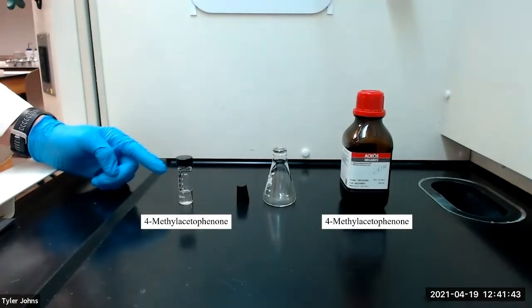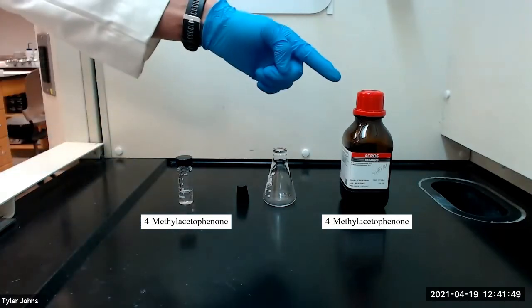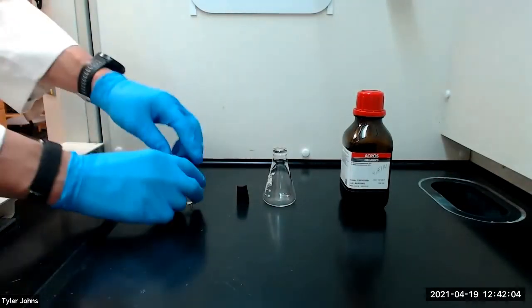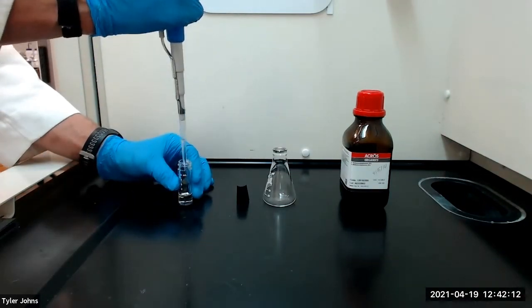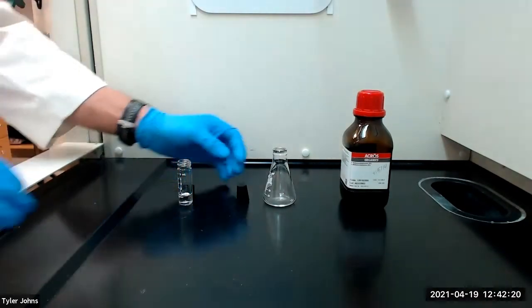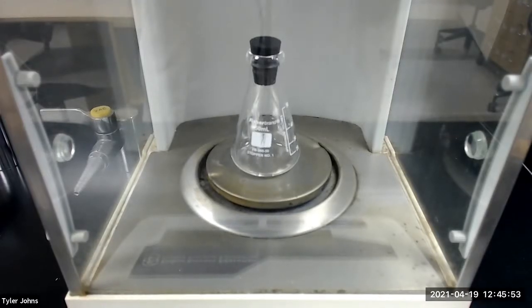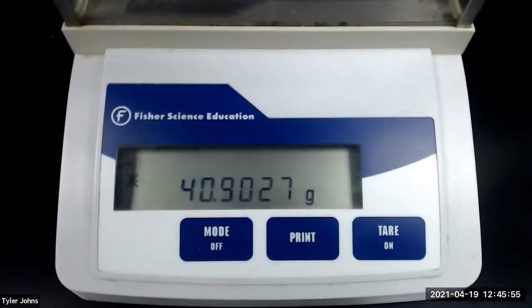If you don't have enough of the 4-methyl acetophenone product or your product's purity was questionable, use the stock 4-methyl acetophenone to begin your experiment. The mass of the pre-weighed flask plus the 4-methyl acetophenone is 40.9027 grams.